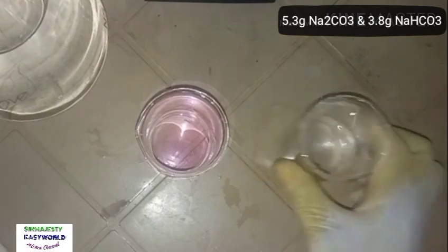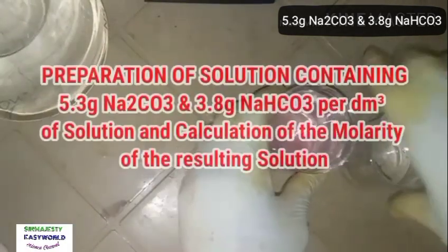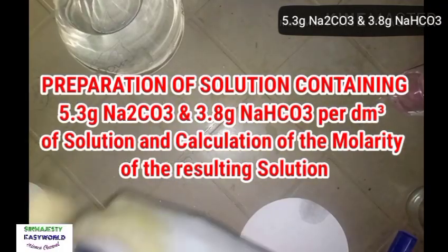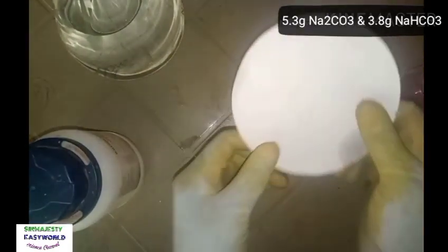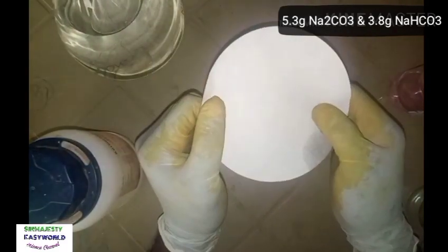The solution B, which we are told to measure, is to get 5.3 grams of sodium carbonate and then 3.8 grams of sodium hydrogen carbonate. What you're going to do is bring your weighing balance. Here I have my triple beam balance, my electronic balance. I can't find it. They took it out from my laboratory.